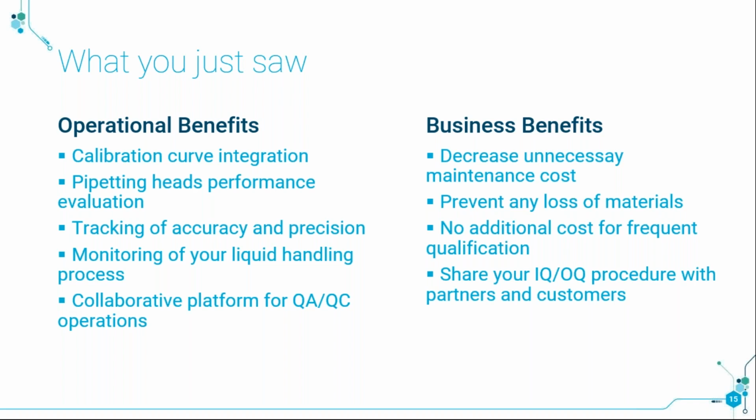As for the business benefits, well, I think that you will all agree with me when I say that overall it can help the QA/QC team and all the scientists in a lab.